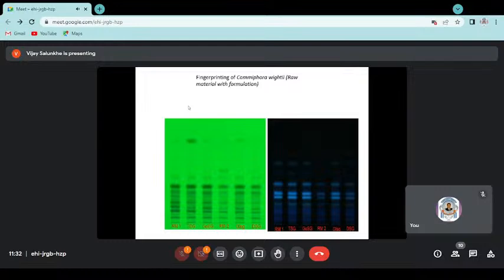So depending upon the nature of the secondary metabolites, you have to use the proper method of extraction. Sometimes ethanolic extract may contain alkaloid, methanolic extract may contain alkaloid, but water extract may not contain alkaloids. That means depending upon the proper system of extraction, you can get the isolation of phytoconstituents, and whatever you want, you can separate qualitatively.